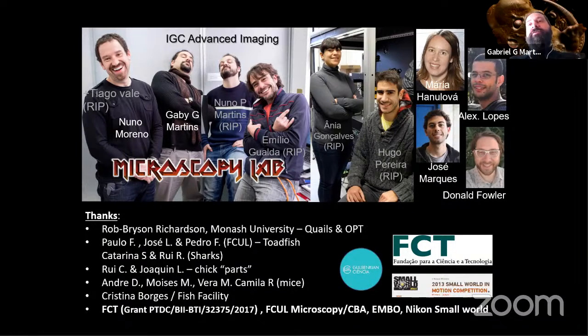And that's in part the reason why you have so many different configurations of light sheets, because you're optimizing for different circumstances and different samples. For example, at Champalimaud, they have two different light sheets. One is optimized just for imaging large things with low resolution, and you can go millimeters and even more than a centimeter in depth. But they also have the same light sheet that we have and that EMBL has, optimized for live imaging, where you cannot image more than a millimeter, and even a millimeter is already a challenge.